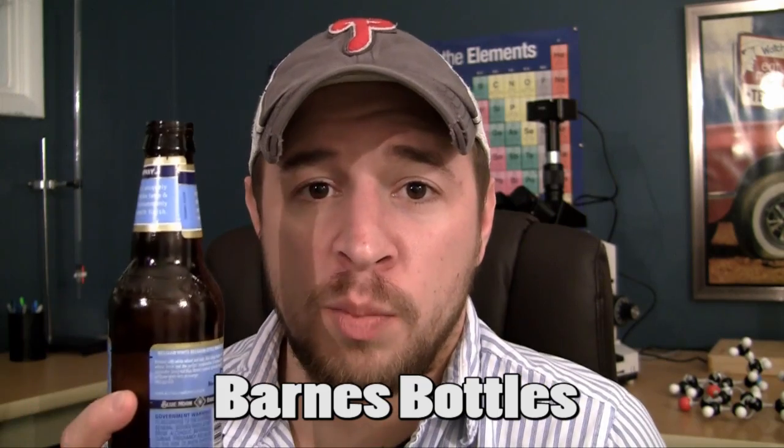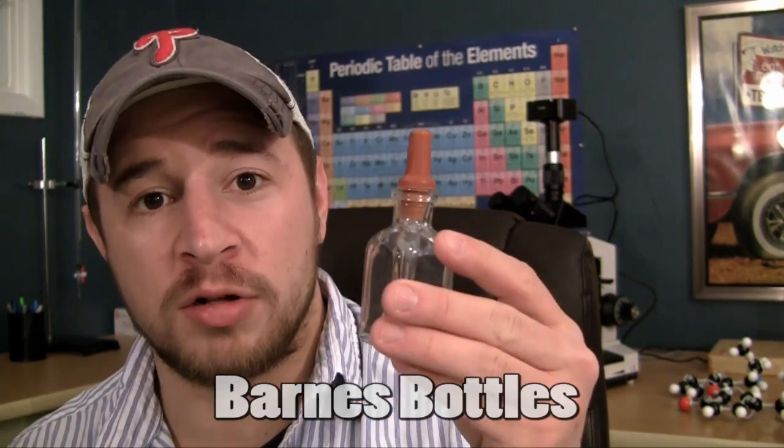What is going on guys? Welcome to another awesome chemistry video and in this video I want to talk to you guys about the Barnes bottle. Oops, not that one. The Barnes bottle.